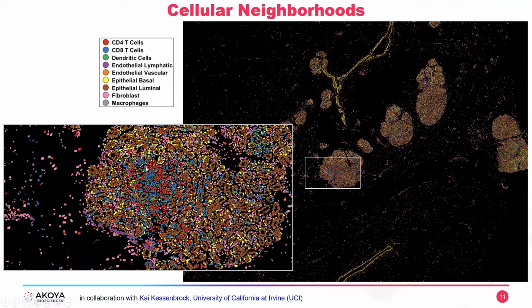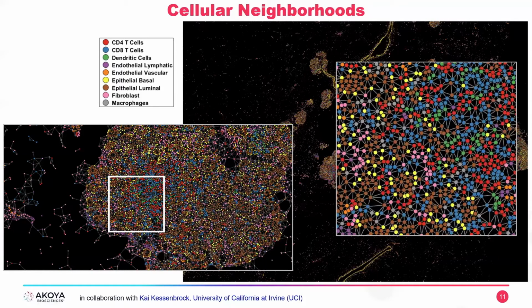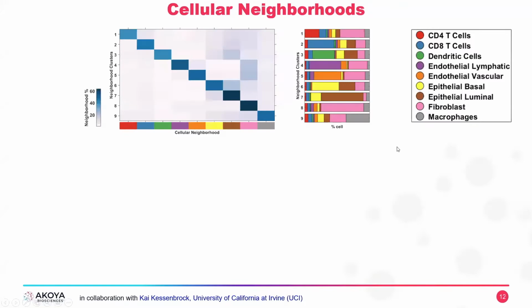And here's where this type of single cell biology really differs from all other types of single cell biology. That is that we know the connectivity of every cell with every other one. It is very easy to draw this map. It's very easy to know that this cell is many dozens of connections away from this cell, and so on and so forth. But having these data now allows you to look at your tissue and to ask questions that you've never really asked before.